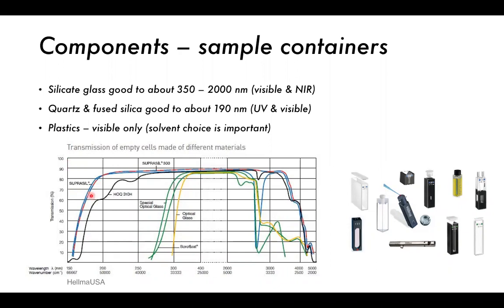So you can see here different things. So we have things like they're different materials, some of them brand names, but you can see the transmission and the amount they transmit here. So it's not completely uniform. It's not like, at 150 they stop absorbing. It's gradually they stop absorbing, but there is always a certain amount of absorption which happens, just because the glass is there, and so it will absorb some of the light.